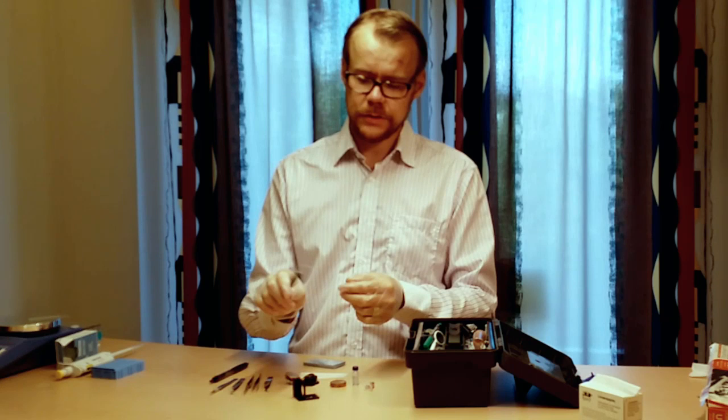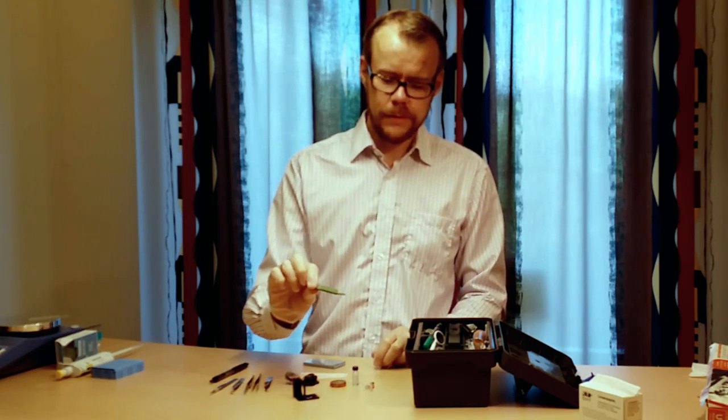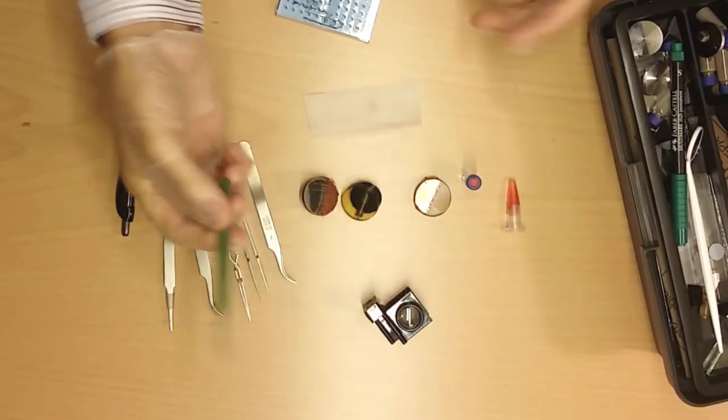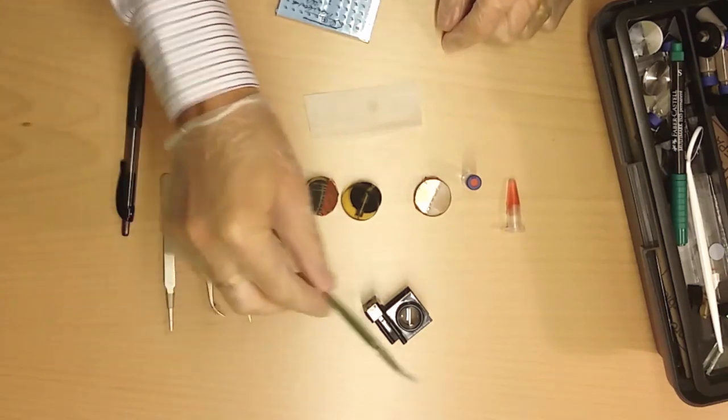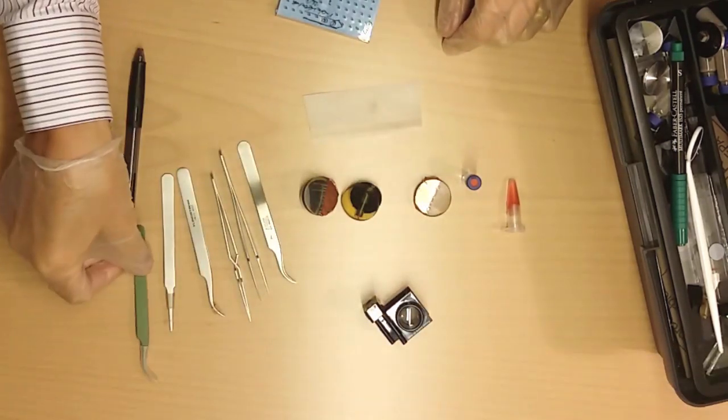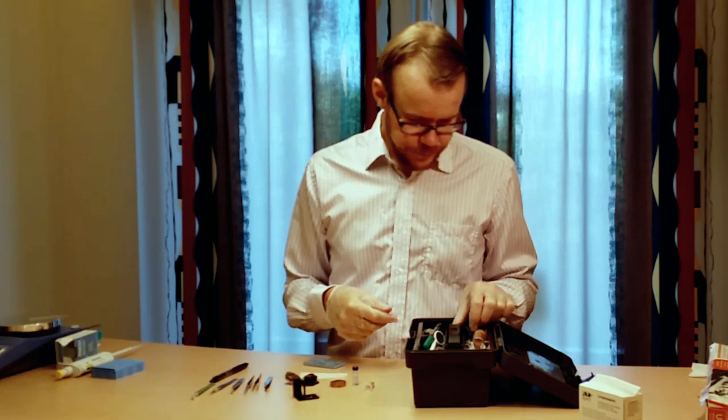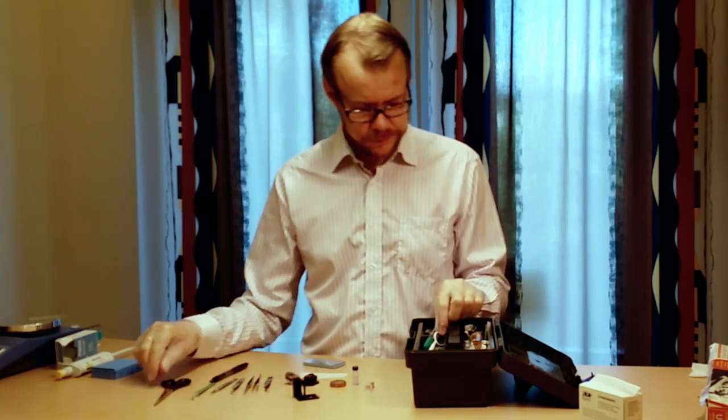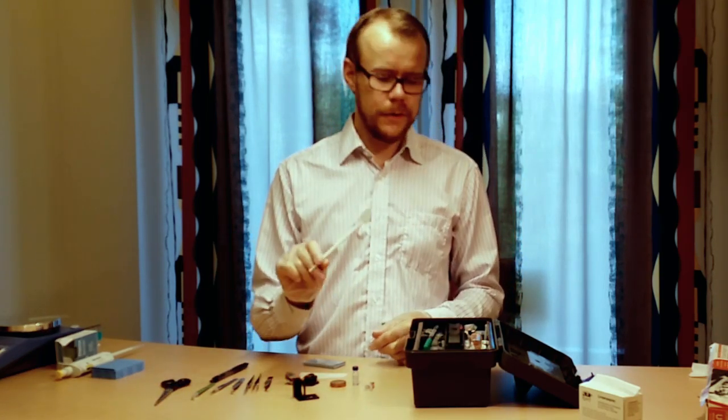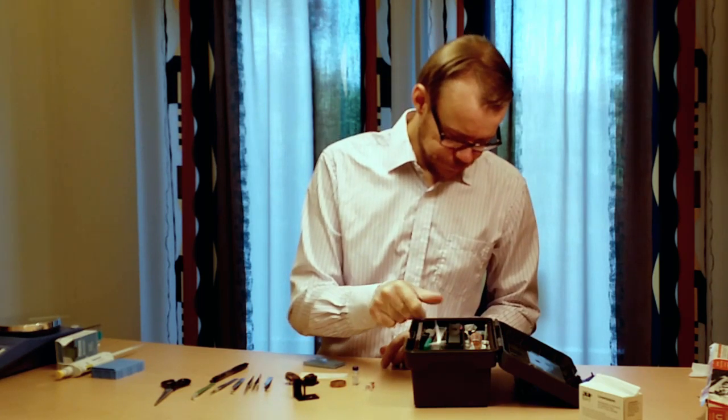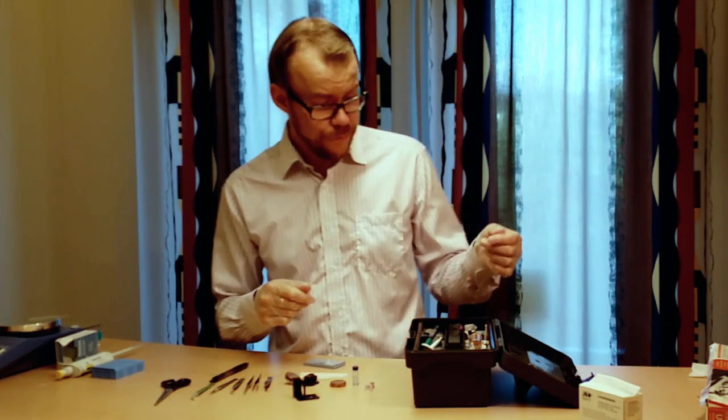Here is another tweezers. This is protected from electrostatic shards. If it is dry humidity then this one is your savior of the day. Scissor. Some mirror can be useful sometimes. When the machine fails for example.